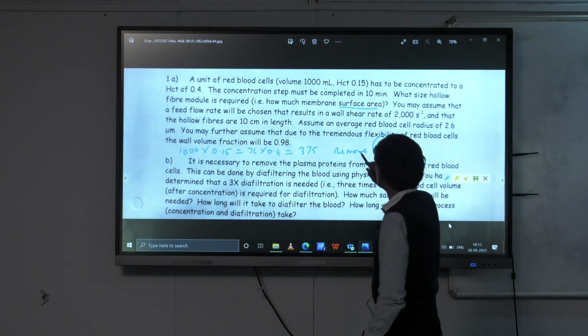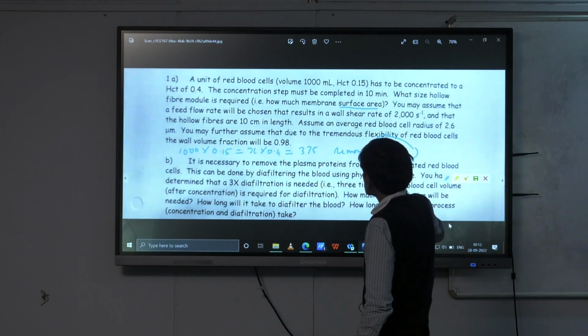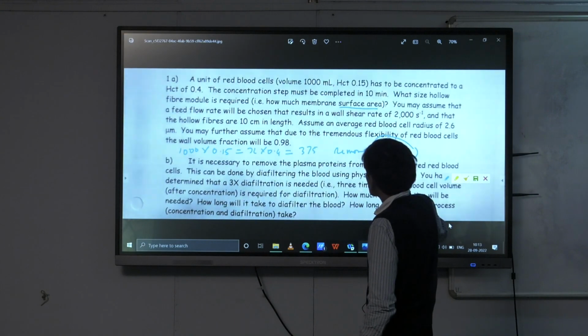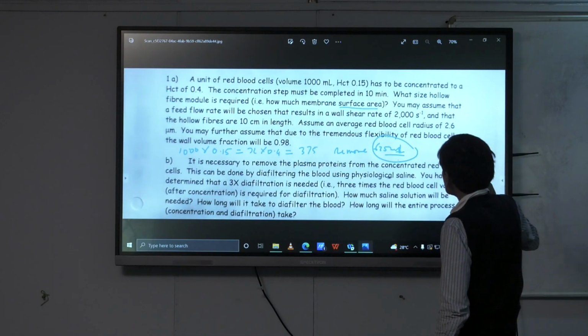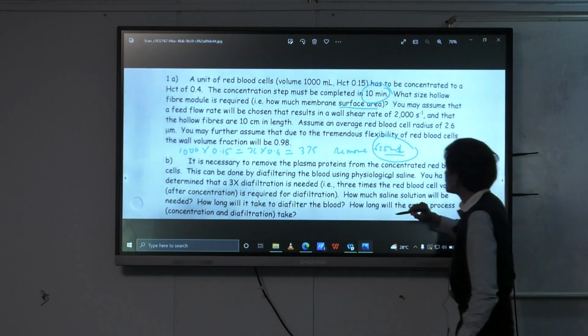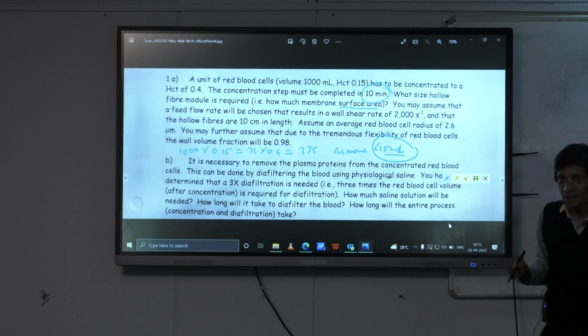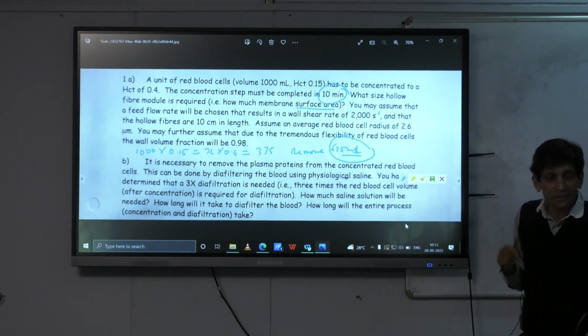Did it tell us? I thought it told us. Didn't it give us a time here? Now I can't see. 10 minutes, I thought, right? Second line. Oh yes, okay, good, thank you. Yep, 10 minutes. Okay, so you need 625 ml in 10 minutes. So we need to figure out what membrane surface area we need. That's the next point.